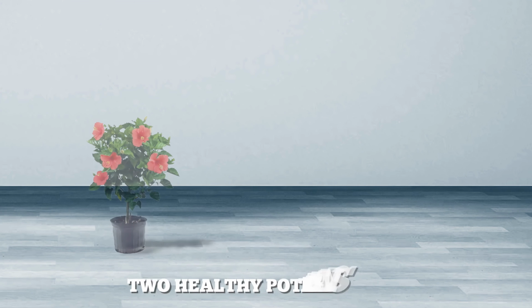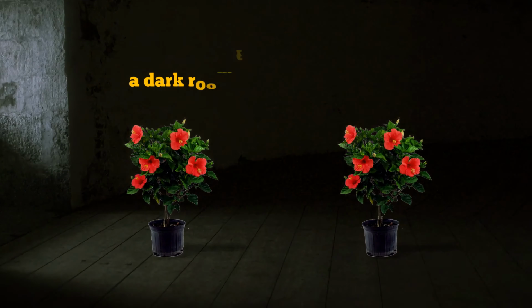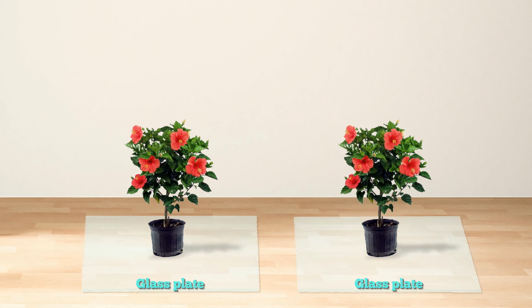Take two healthy potted plants, which are nearly the same size. Keep them in a dark room for 3 days. Now place each plant on separate glass plates. Place a watch glass containing potassium hydroxide by the side of one of the plants. The potassium hydroxide is used to absorb carbon dioxide.